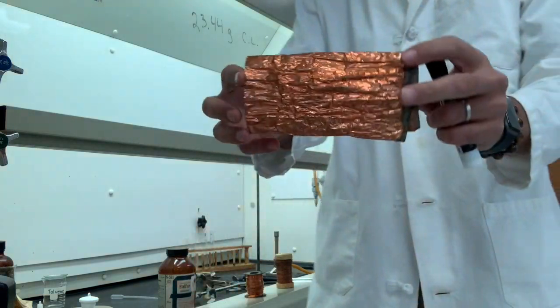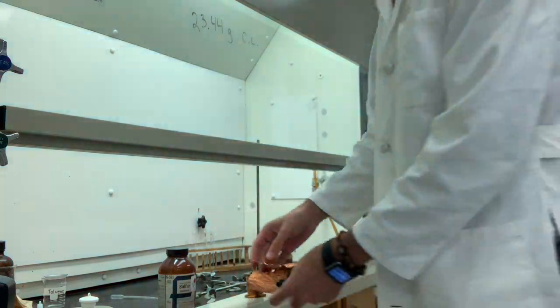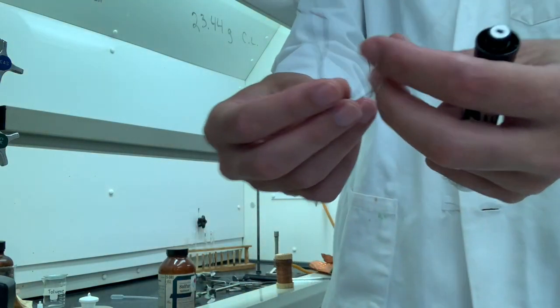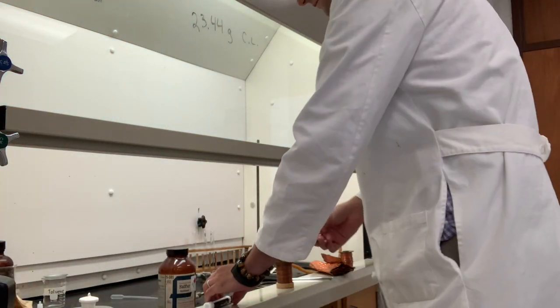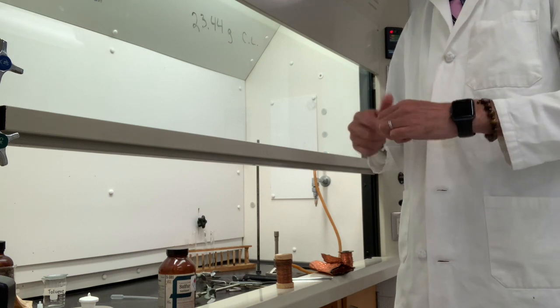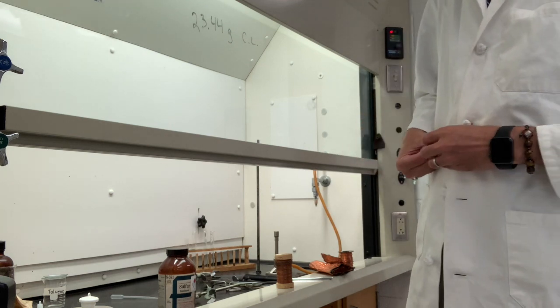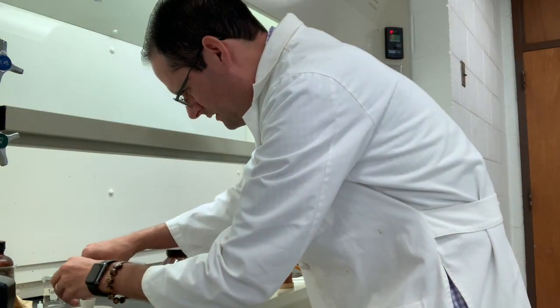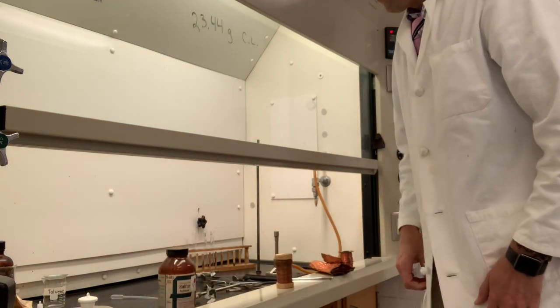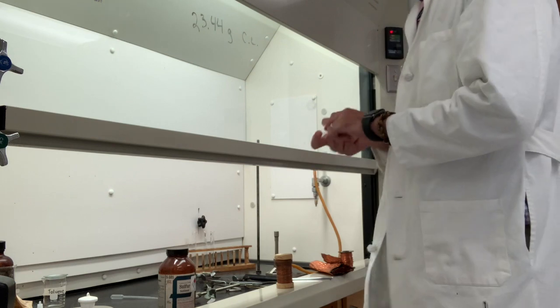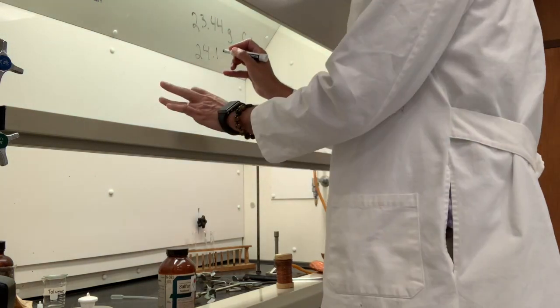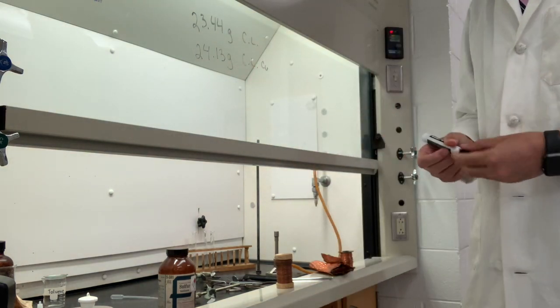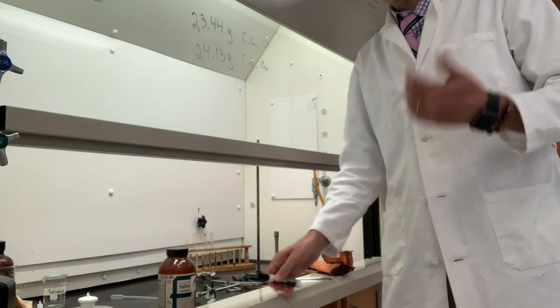Now copper is a nice colored element. As you know from your copper pennies, it comes in foil, wire, and I'm going to be reacting this small piece of copper wire. I'm going to wind this up a little bit so it fits in the crucible. So that's the mass of the crucible, the lid, and the copper. By difference, I can figure out the mass of the copper and I can know the moles of the copper.